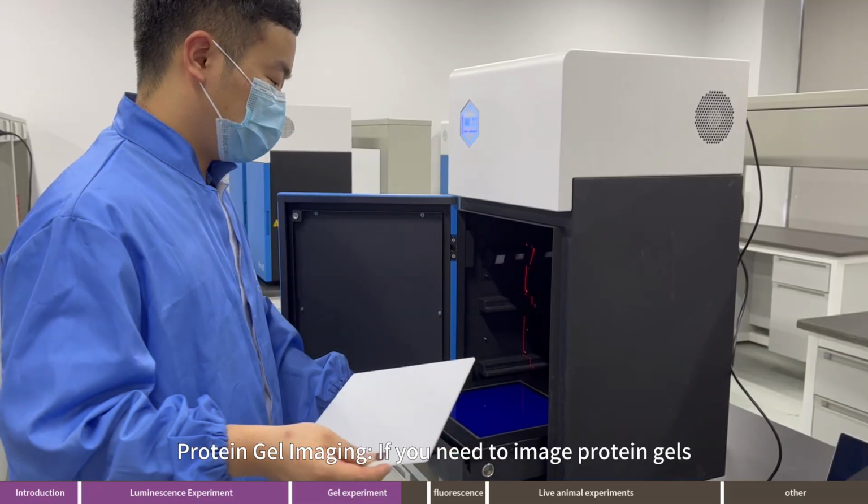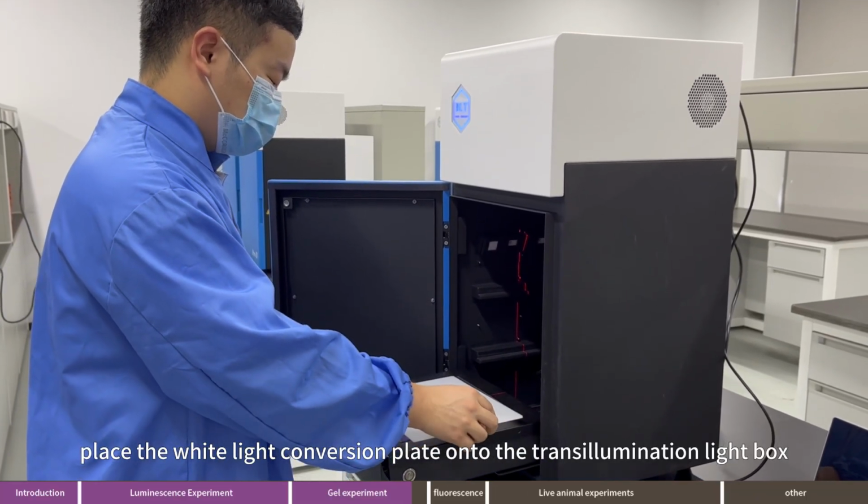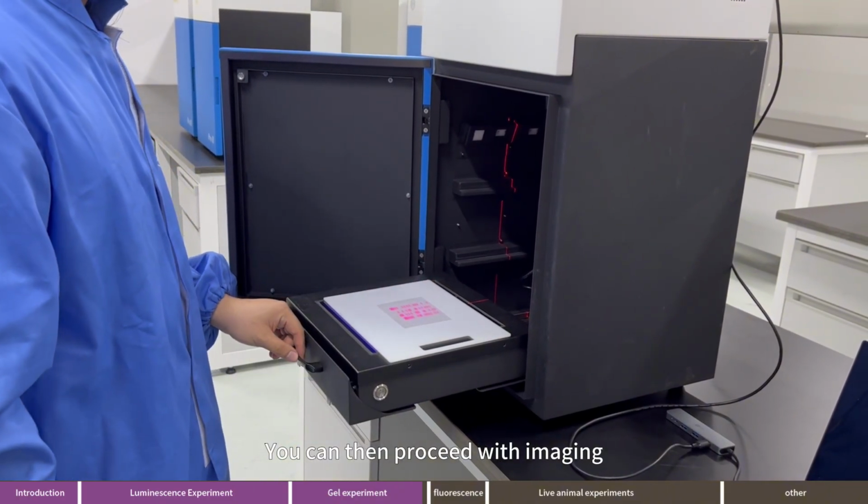If you need to image protein gels, place the white light conversion plate onto the transillumination light box. Then place the sample on the white light conversion plate. You can then proceed with imaging.